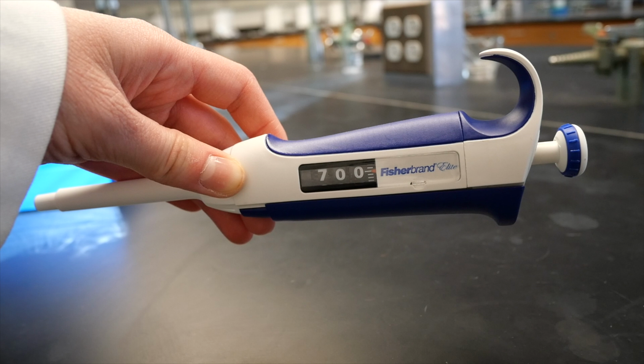This is a P1000, so it does 1,000 microliters or 1 milliliter. Right now, the volume says 700, so that's 700 microliters. Every time you hear a click, that's me turning the dial, and it is going up 1 microliter.